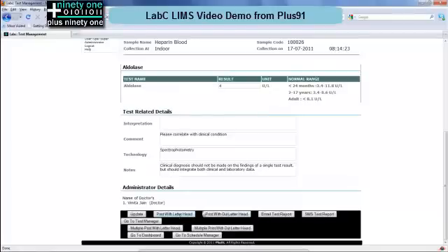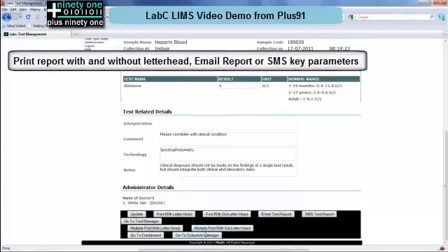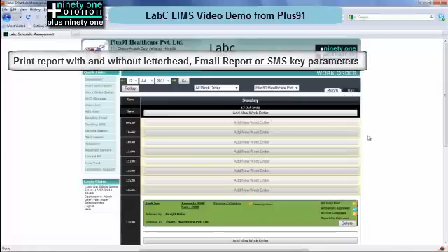You can attach the doctor's signature to this. You can also print with the letterhead or without the letterhead. You can email the test report and SMS various test parameters from here.